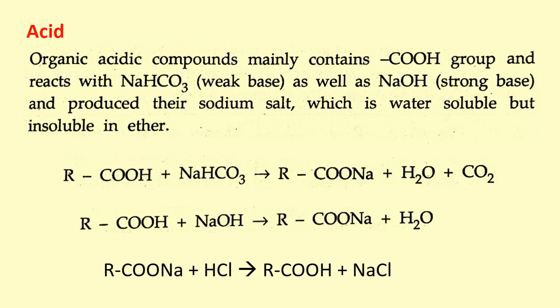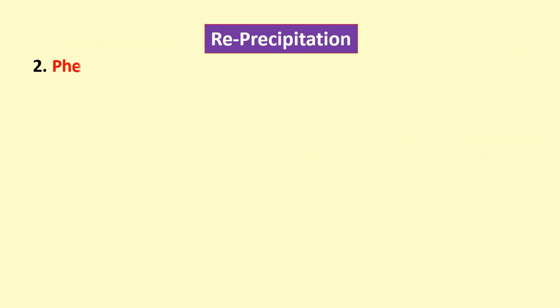Okay, so next, reprecipitation of phenol.